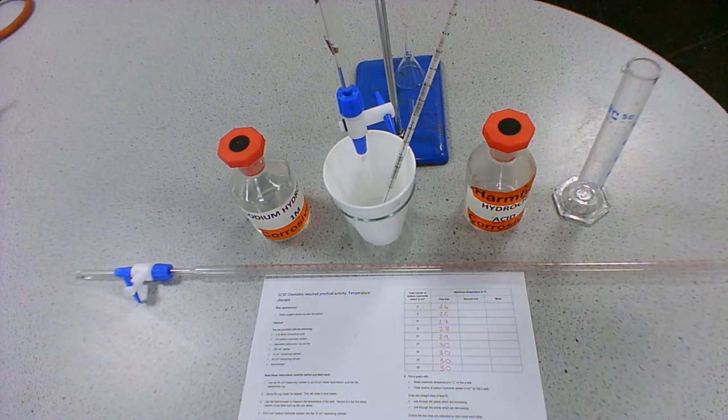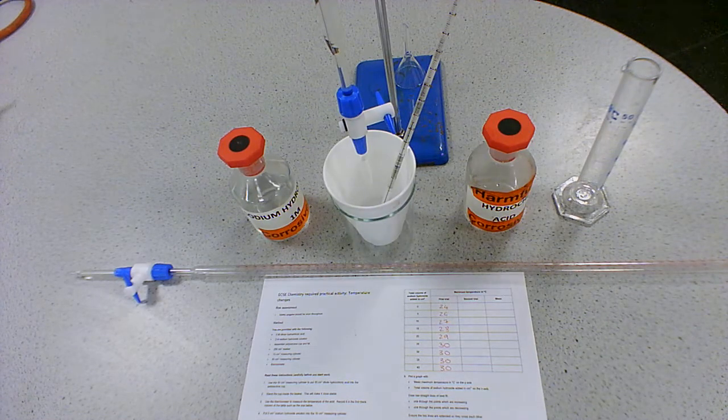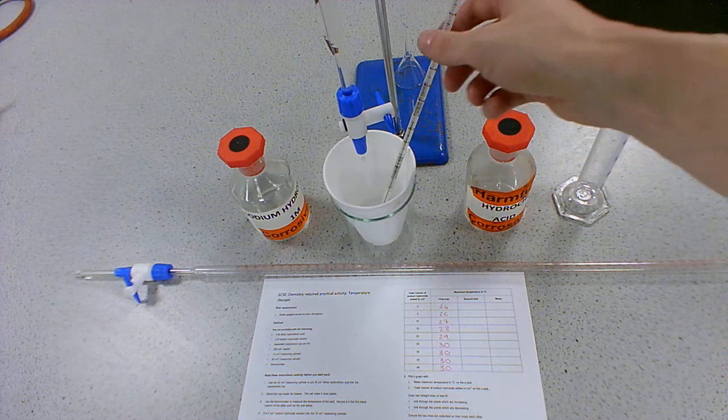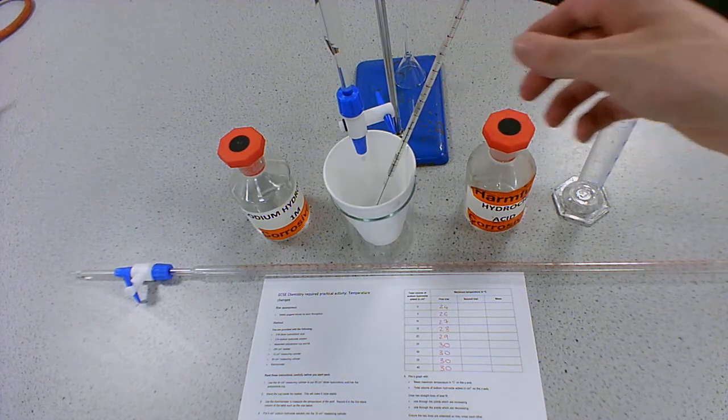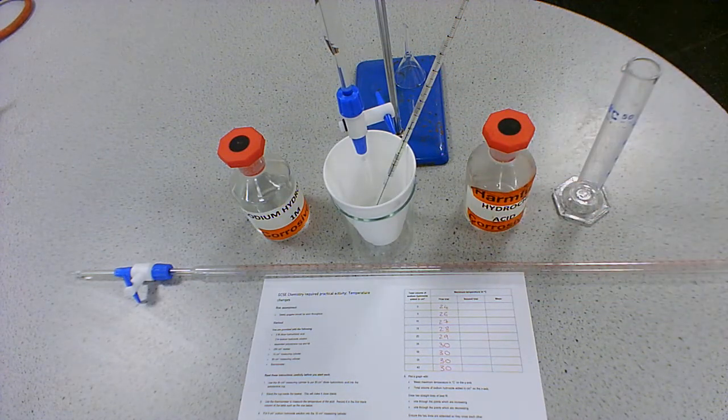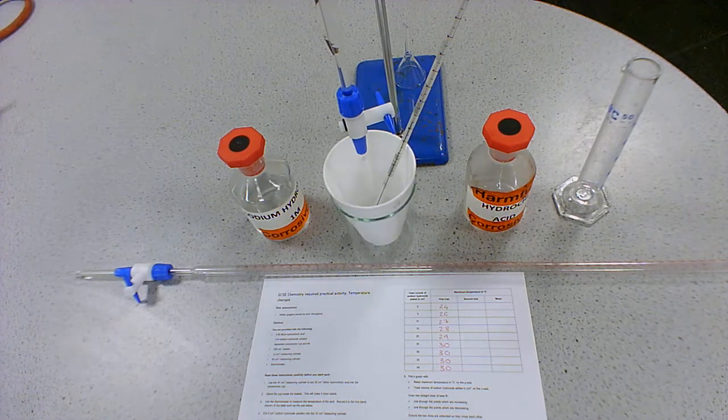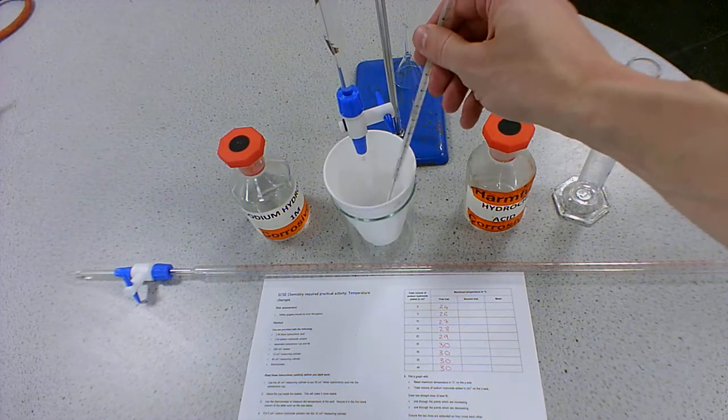And the opposite, if it was an endothermic reaction, again, we wouldn't want too much heat energy from the surroundings increasing the temperature. So by using a polystyrene cup, we are insulating the reaction so we can get a more accurate reading for the temperature change.